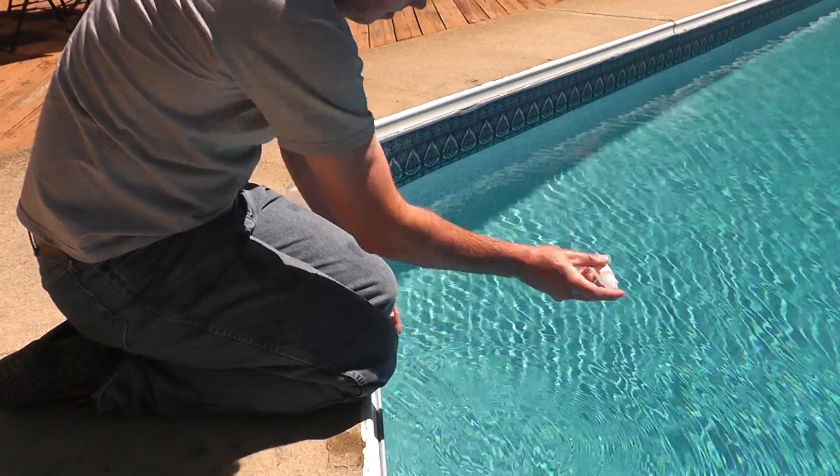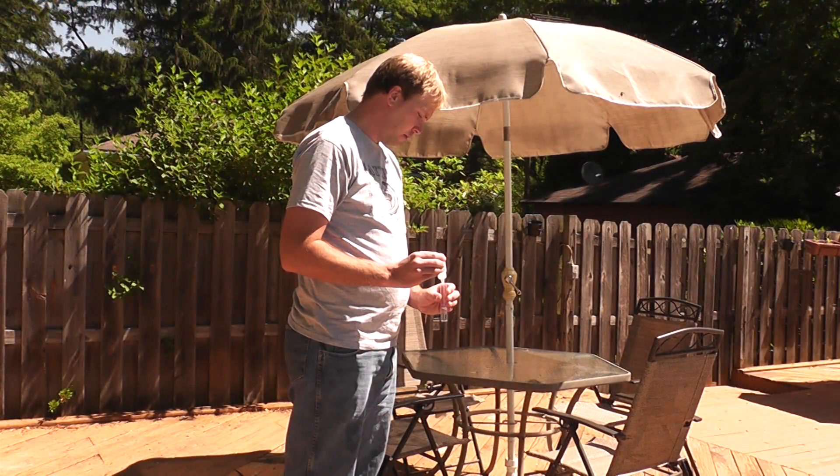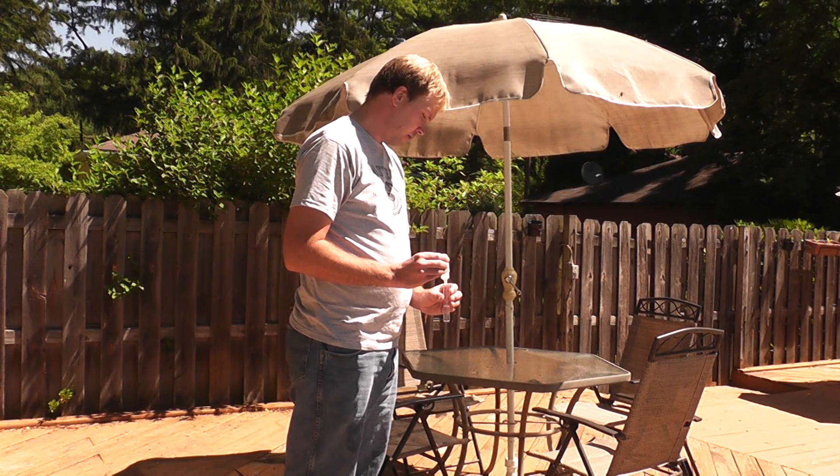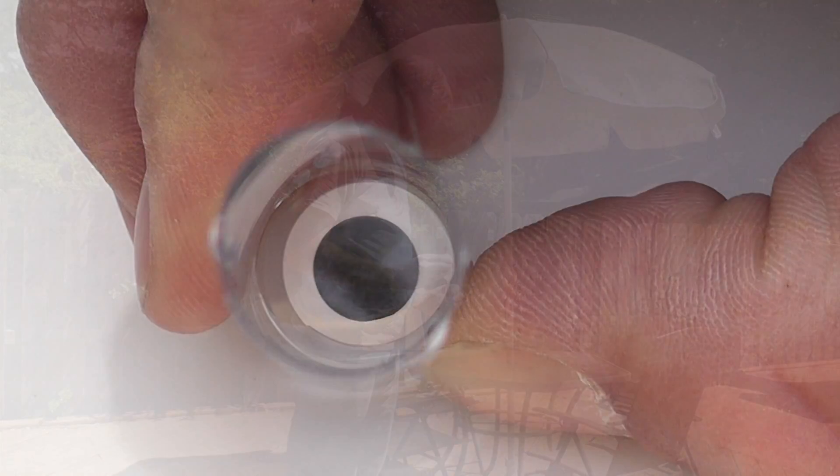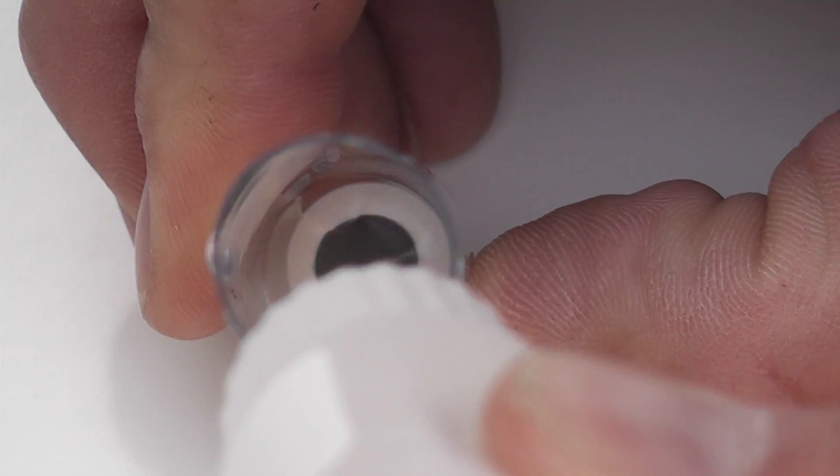Mix, then wait about 30 seconds, then mix once more. With your back turned towards the sun, hold the view tube at waist level and slowly pour from the mixing bottle into the tube. Continue filling the view tube until the dot is obscured.